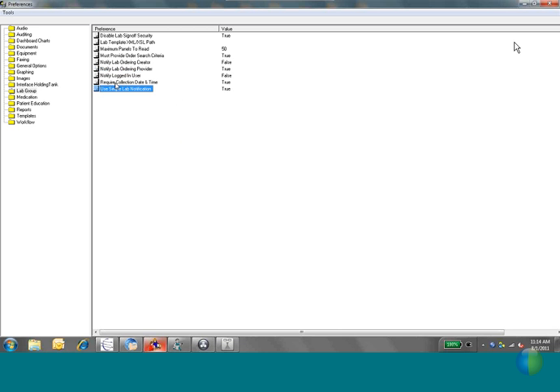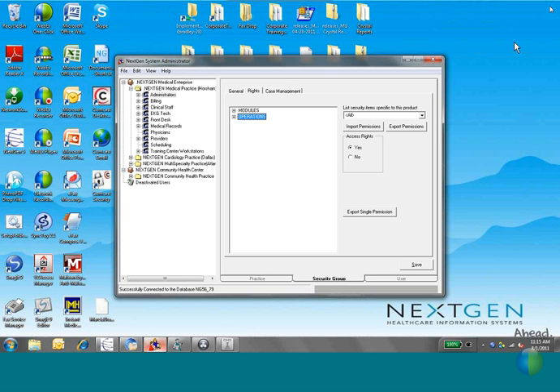You can also do things like require the collection date and time. If you turn this particular option off, use simple lab notification, that'll take away your tasking. So right now I've got mine set to true, so I do receive tasks upon results, but you can turn that off so that it would just simply go to the PAQ instead of to the tasking. And more or less, that's all you're going to have to do for your orders module for system administrator. Couple security rights and a couple universal preference settings.